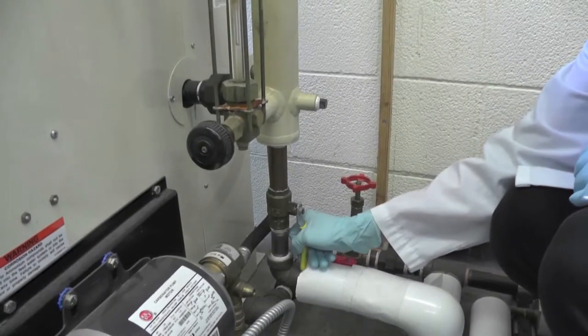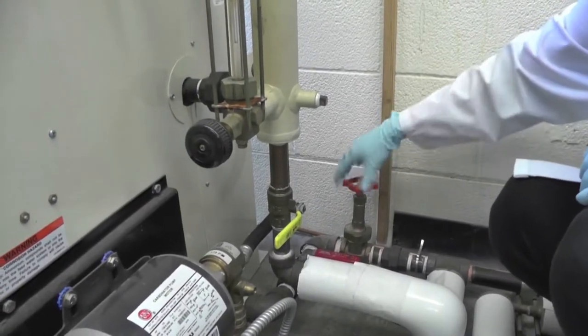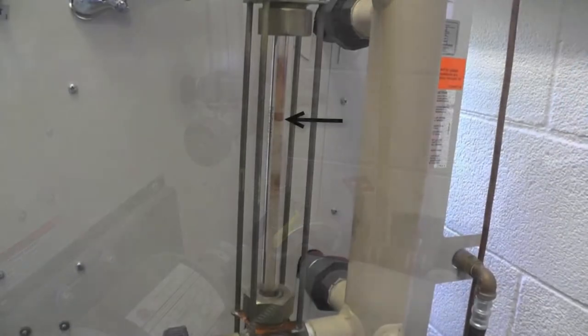After the draining stops, pull the yellow lever back up and tighten the red knob by turning it clockwise. The water level in the glass should rise back up.